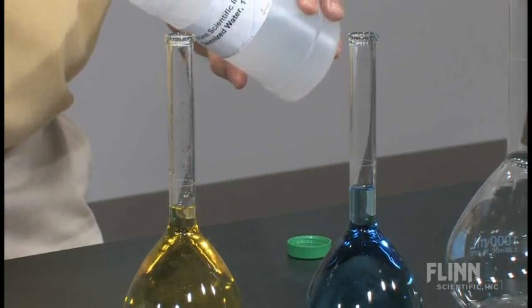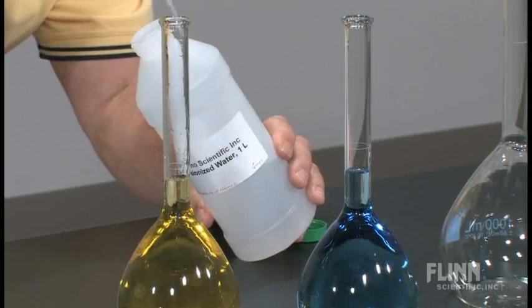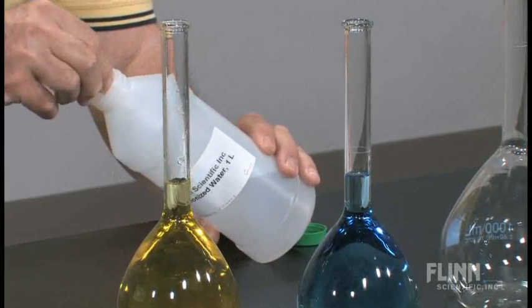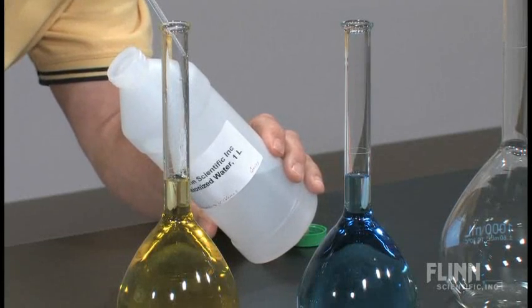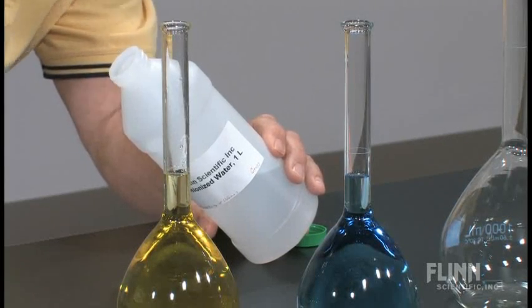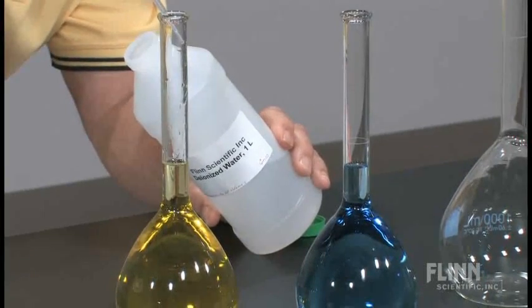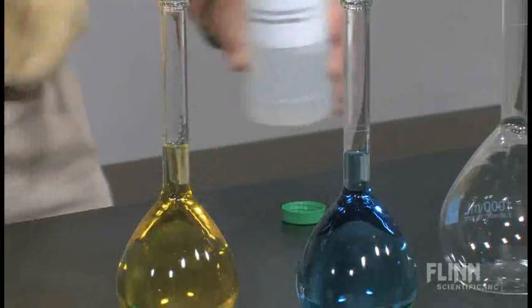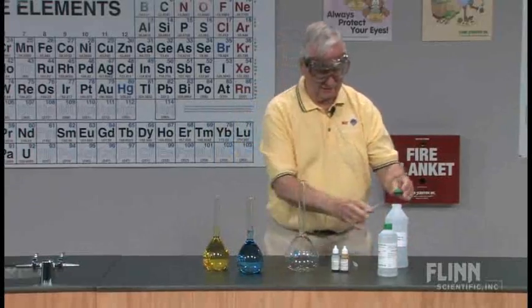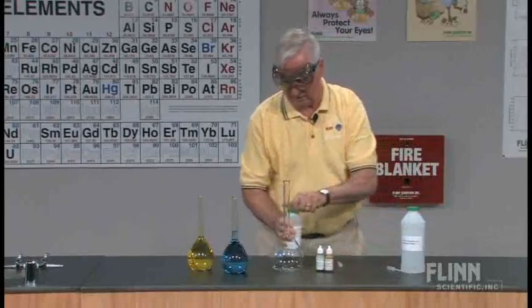This is an excellent use for some of those volumetric flasks you may have laying around your classroom that you didn't know quite what to do with. If you aren't preparing your own solutions, you probably don't need them or don't use them. This is a very good use for them. Top that off so we have exactly 500 milliliters of water. I'm going to do the same with the alcohol.